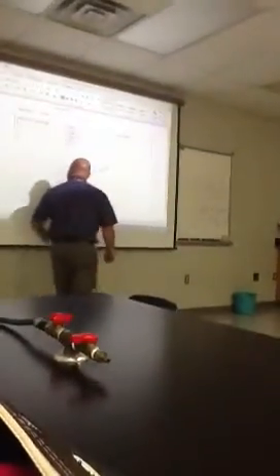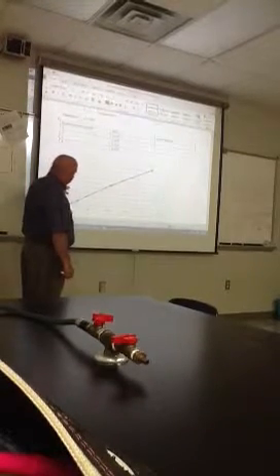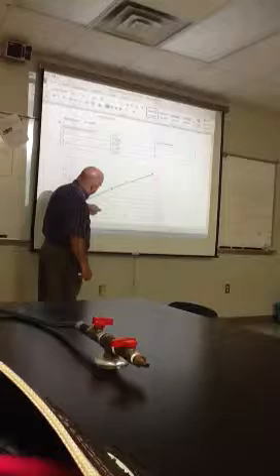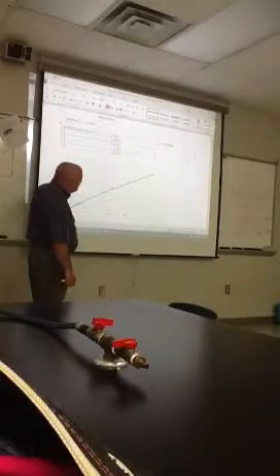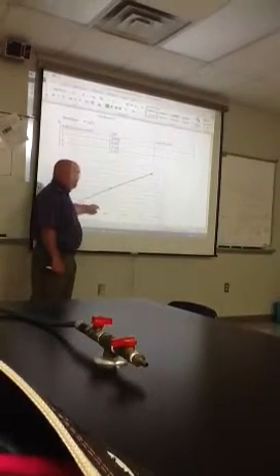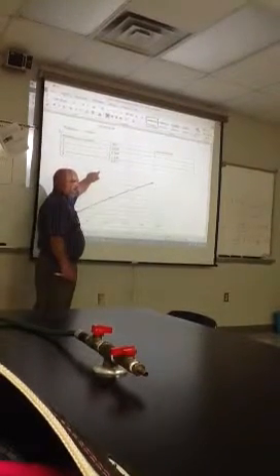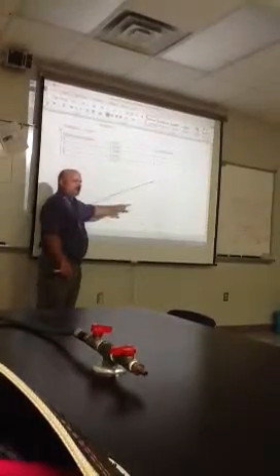82.6 something. Your math teacher way back in the day always taught you to go back and look at your answer and see if it was reasonable. So if we did our math, it should be reasonable. So if we have an absorbance of 0.678, that's somewhere up in here, and I work back over here to about where 82 would be at, and this is going to be 0.6, so it's close to 70, somewhere in there. Is my answer reasonable? Yes, that's a reasonable answer. If I came up with an answer like 182, no, that answer would not be reasonable on my graph.